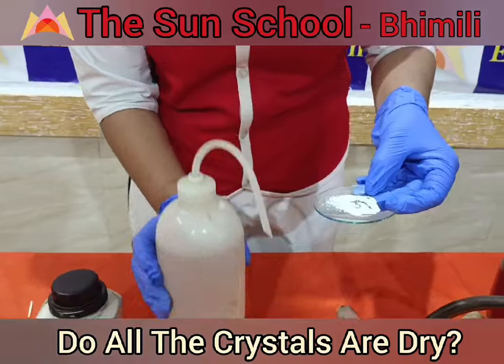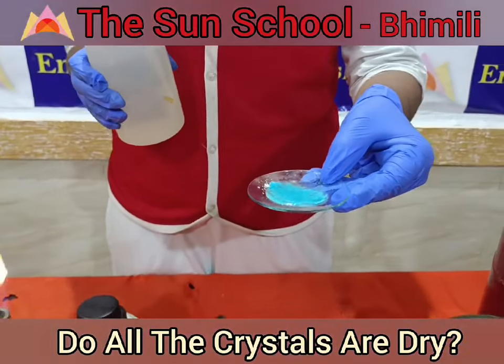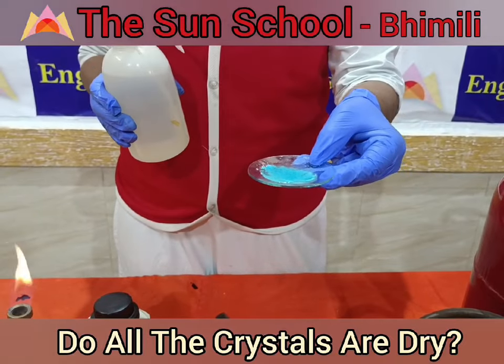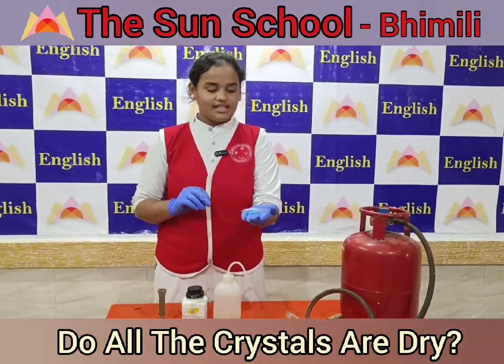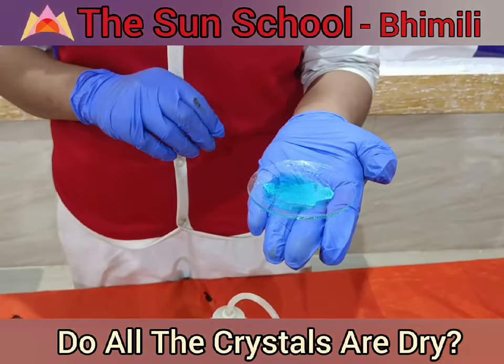Now add some distilled water to it. We can observe that it turns blue again. From this we can conclude that some substances are crystalline in nature and contain water molecules.